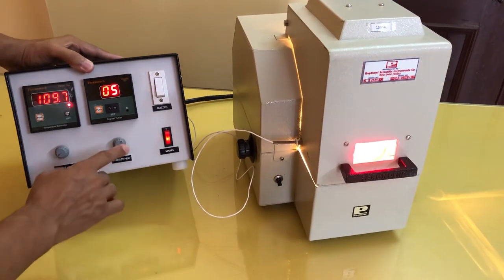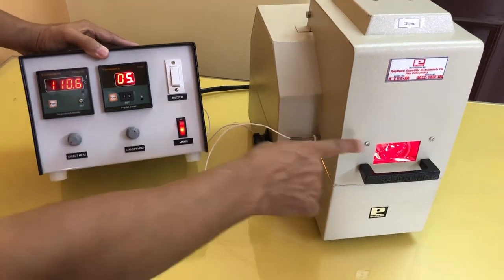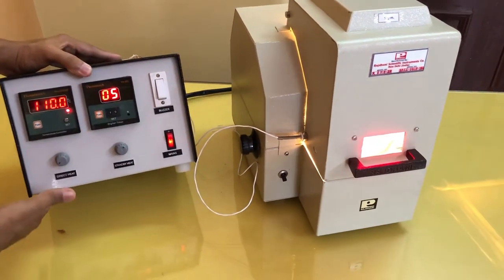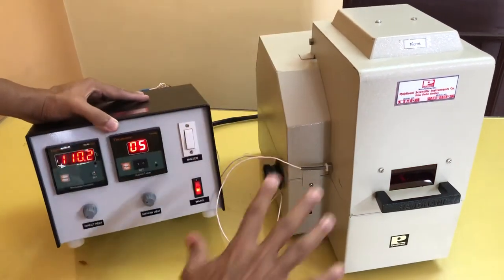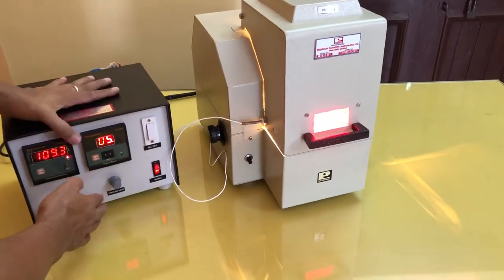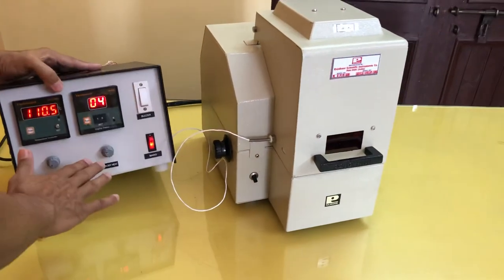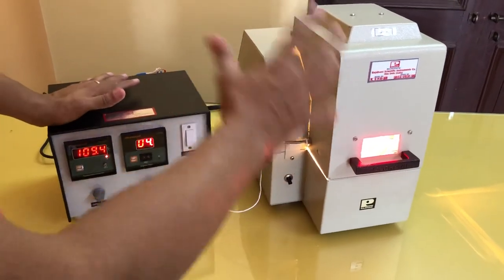One thing you have to remember very carefully: when the main heat is off, the intensity of the standby heat should be very small — it should not be higher. If it is higher, it will keep on increasing the temperature. I suggest you first keep this position to off and work the instrument completely. When you have done this 4, 5, or 10 times, then you can understand the working of this standby heat very easily. Even if it is in off position, the instrument will work properly — it is just an additional feature. You should use this feature only after understanding the instrument.